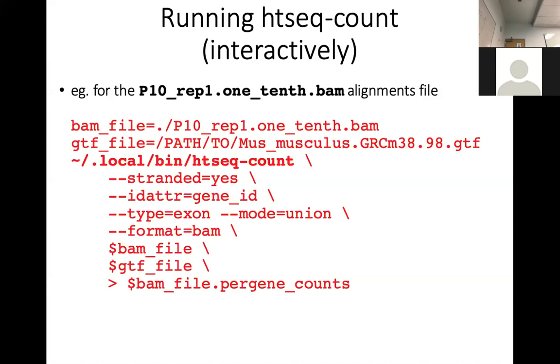Okay, here. So I should get rid of the dollar sign, I guess. Yes, because you can check the individual variables, like echo $FASTQ_file. It's going to show you exactly what you have put into the FASTQ file variable, because this is what you're giving to STAR, right? Right. So input file, the FASTQ file variable.